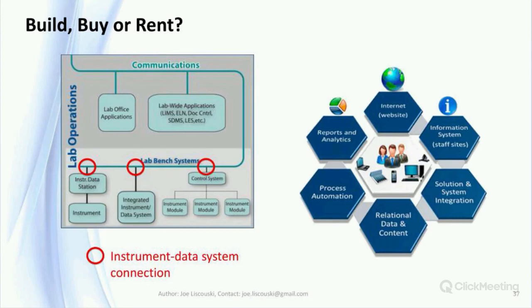Before you get into these discussions, you should have a solid set of user requirements documents with critical functionality identified and justified to provide a basis of discussion. In most cases, this is a deal breaker for ERP integration. Once that's realized, the "do you really need that" discussion begins, and that's up to you to justify.